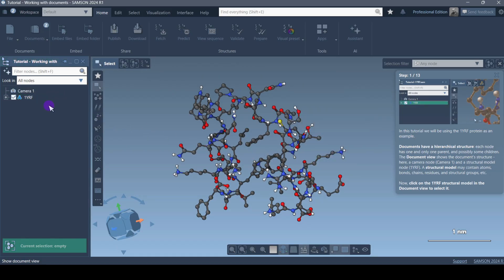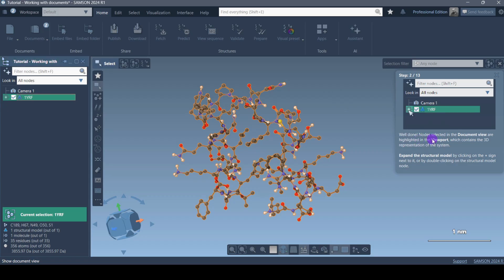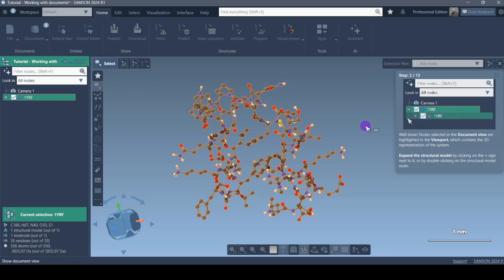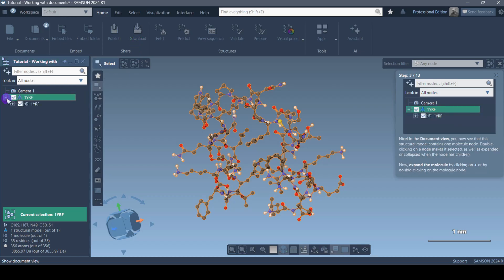So what we have to do next is click on this one to complete step one. SAMSON says 'Well done!' — nodes selected in the document view are highlighted in the viewport. I can see my entire protein is now glowing, which contains the 3D representation of the system. Next: expand the structure model by clicking on the plus sign. We have this plus sign and if I click on it, it becomes a minus sign.